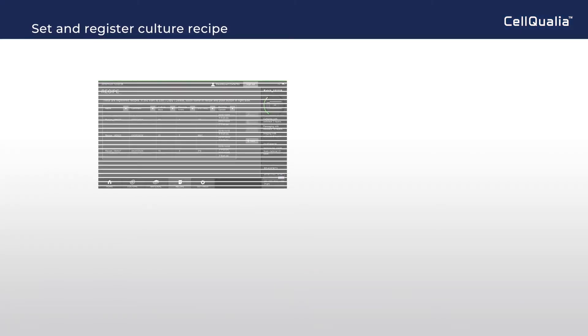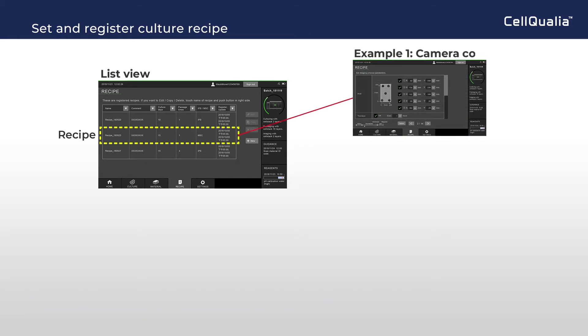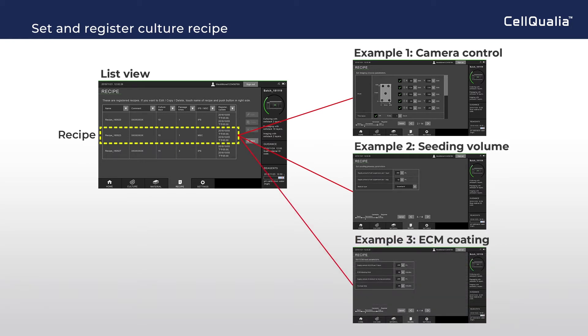The culture recipe needs to be set and registered in advance. In list view, registered recipes can be found, and each recipe is composed of camera control, setting of seeding volume, parameters in ECM coating, and so on. Users can recall registered recipes and edit them.